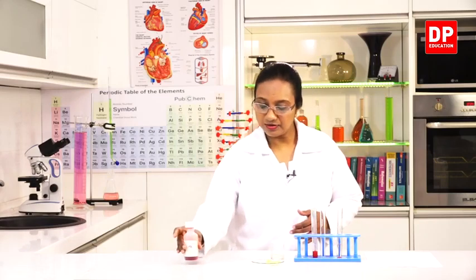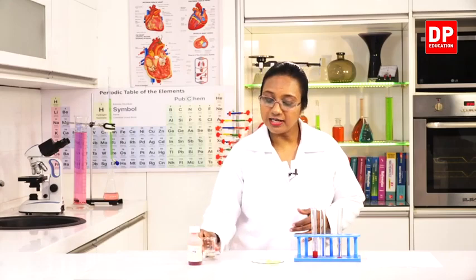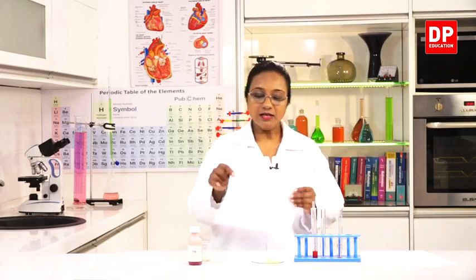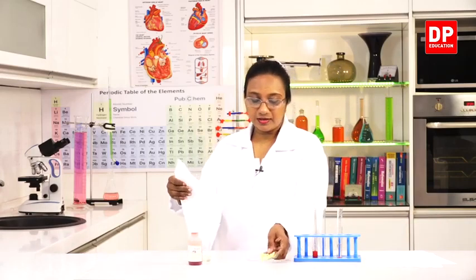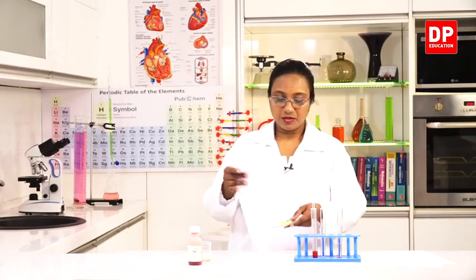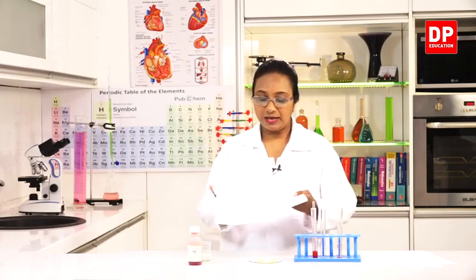You cannot use the same reagent because this is in the solid state. So what we will be doing is we will use a white paper. Any white paper is okay, and we take a small sample of butter onto this white paper.